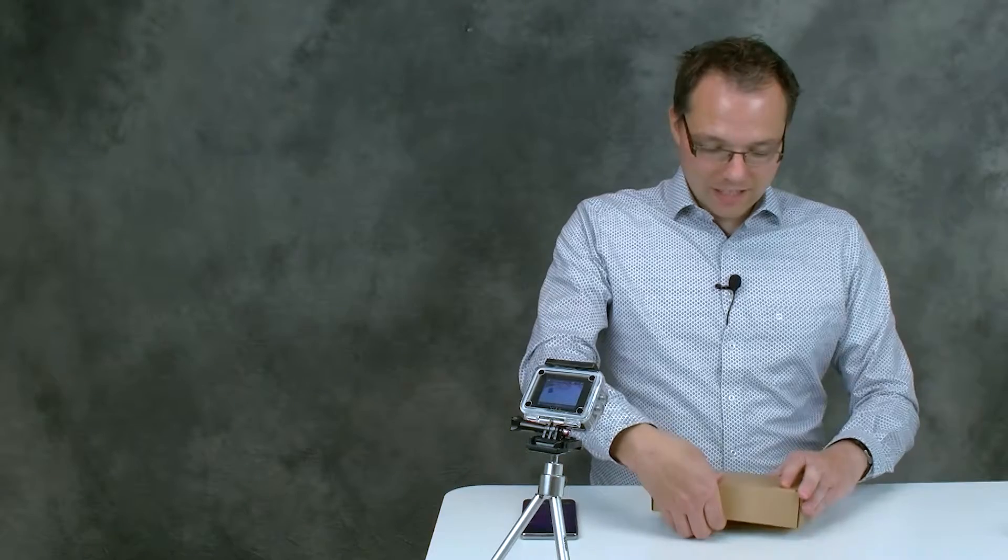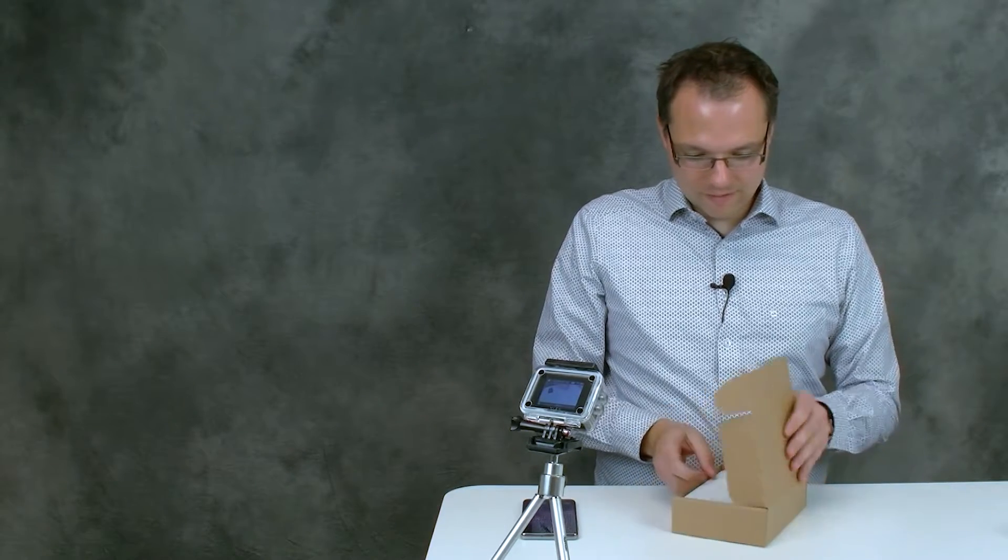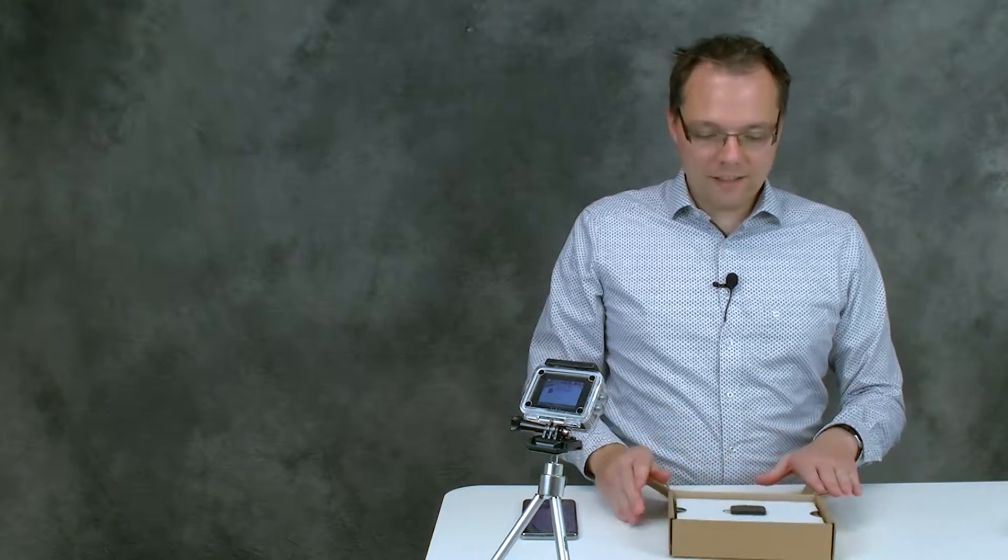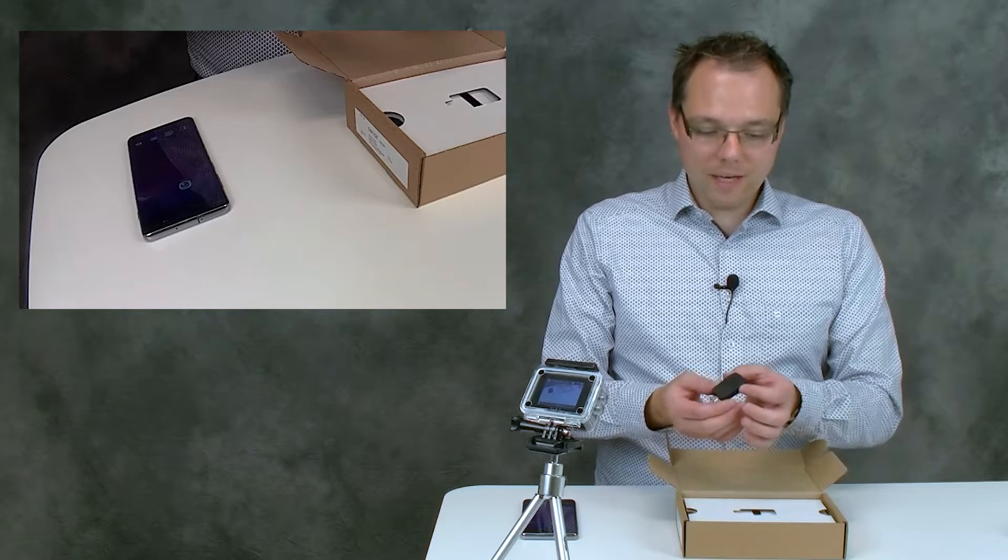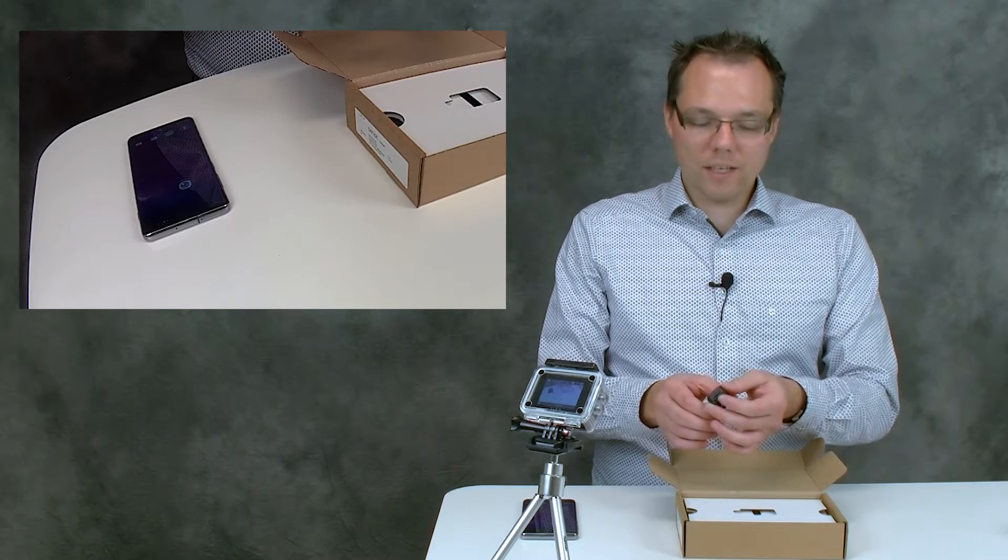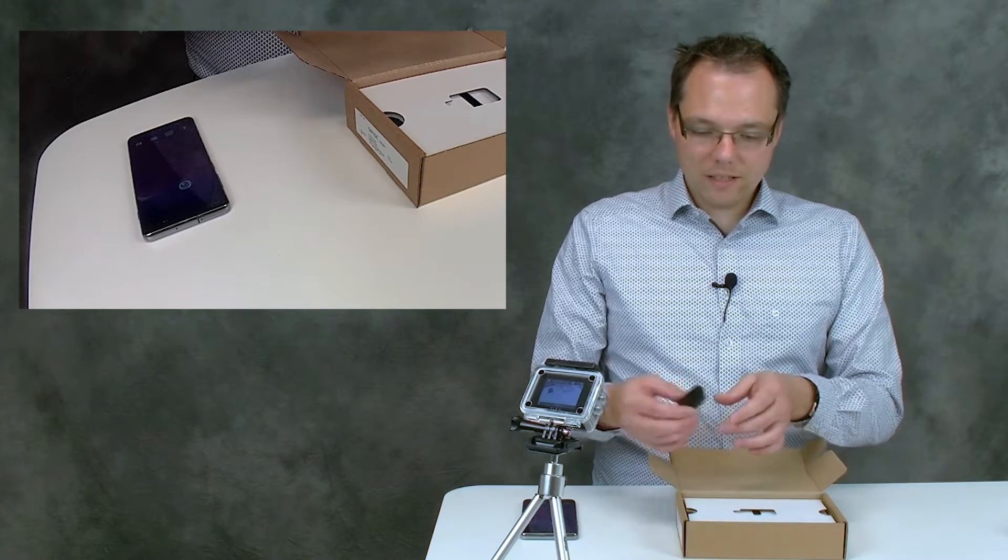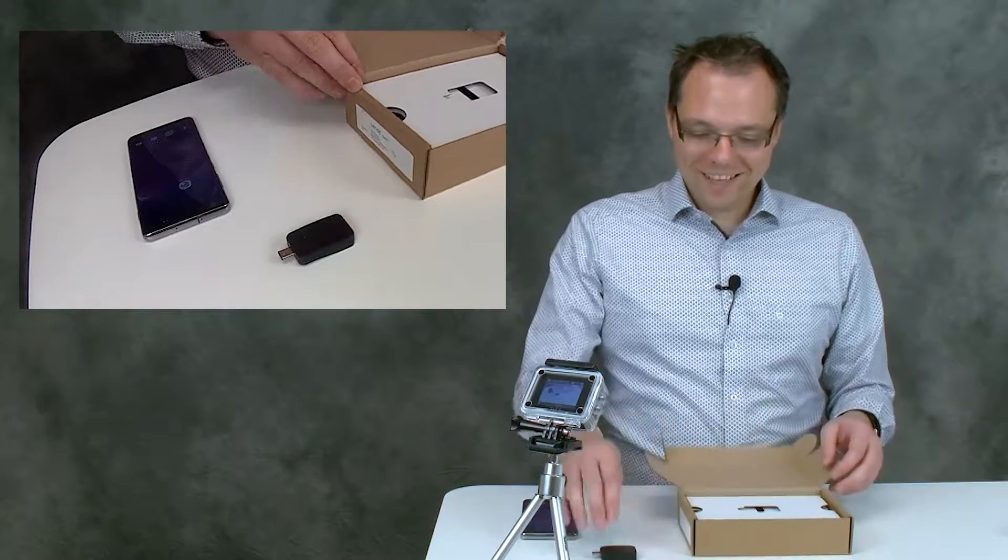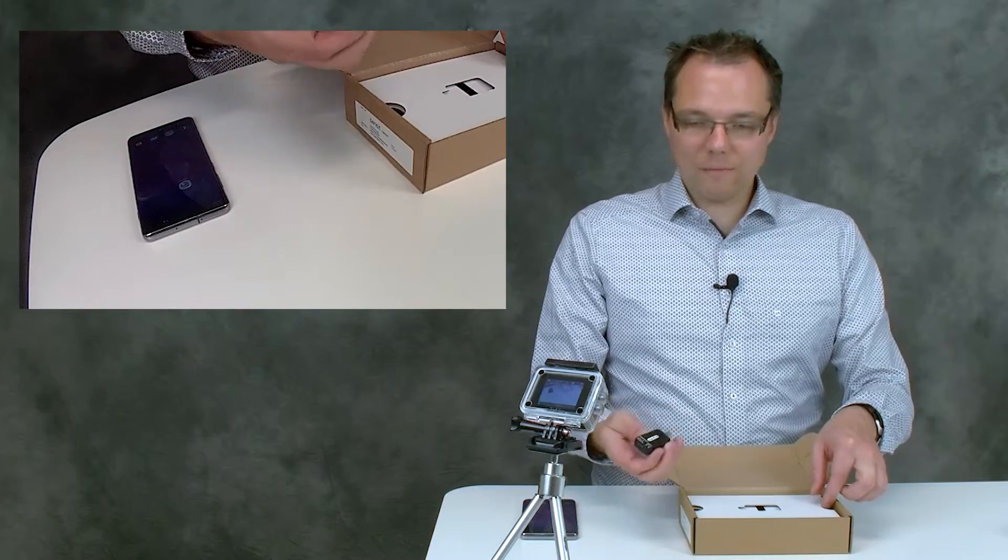We remove the sleeve and open the box, and in there we find the Sensit Smart. As you see, the Sensit Smart has only the screen-print electrode connector and a USB-C connector, and that's it. On the back you find the serial number.